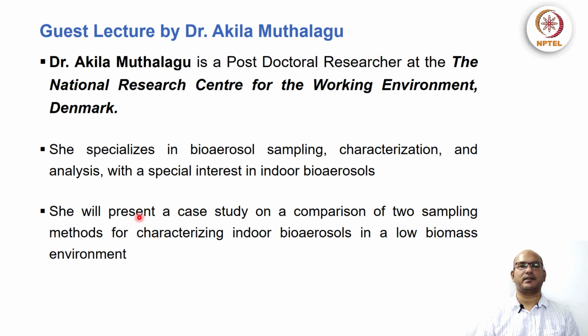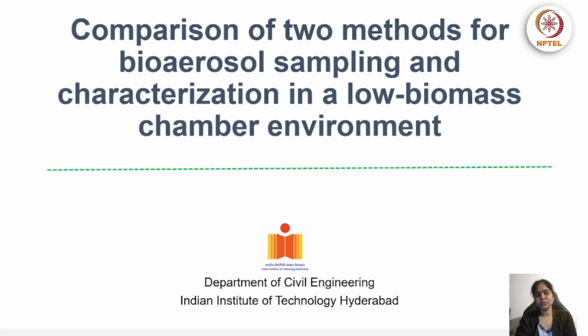She will present here a case study on a comparison of two sampling methods for characterizing indoor bioaerosols in a low biomass environment. Hello everyone, welcome to another lecture on indoor air pollution monitoring. In today's lecture, we are going to see a case study on comparison of two methods for bioaerosol sampling and characterization in a low biomass chamber environment.